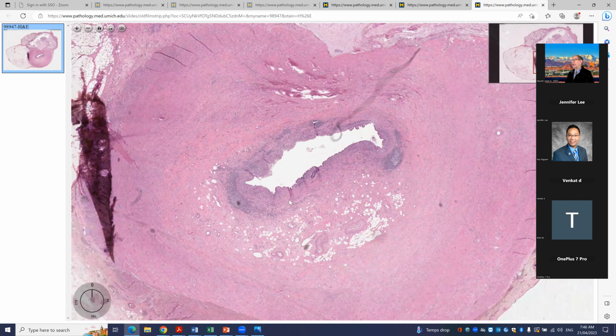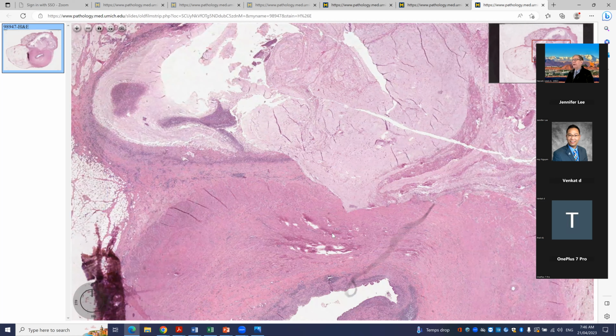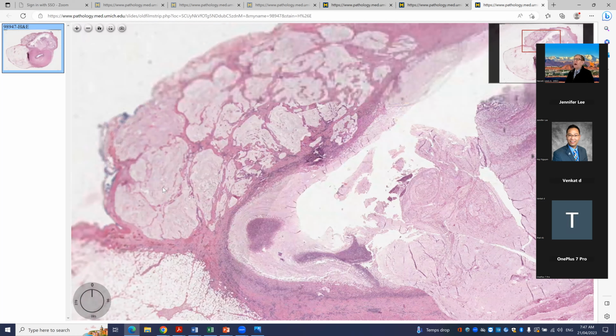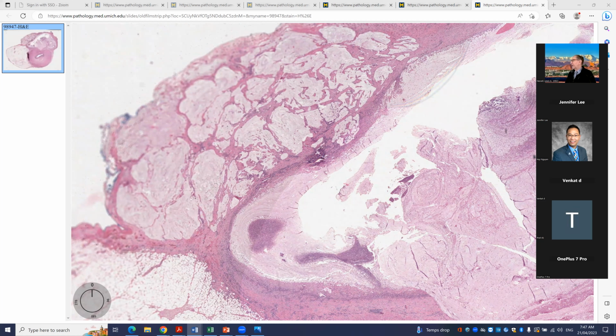So that's a little discussion about peritoneal involvement with mucin, which is acellular and does not have evident epithelial neoplastic cells out here in the peritoneal mucinosis. Okay, we'll take a little different variation on this and look at case number 7. We're going to have to go more quickly to get through here.